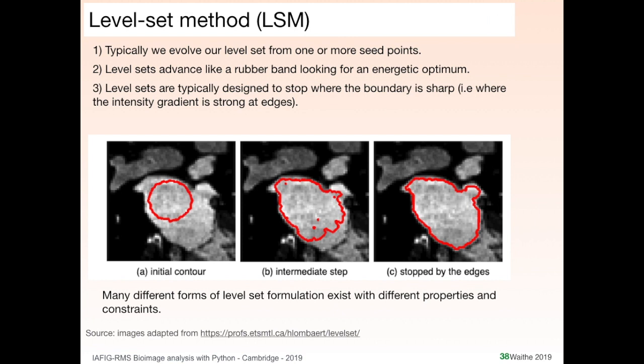But this is more numerically demanding, where we define this energy term, which can have a lot of different influences on it, like the smoothness of the contour, how the intensity changes, and whether the texture is similar. There are many papers going into this and different approaches, and everyone thinks theirs is the best. But Virginie will talk more about that tomorrow.